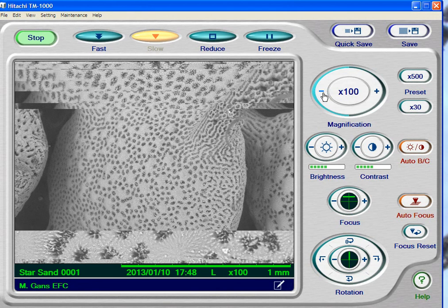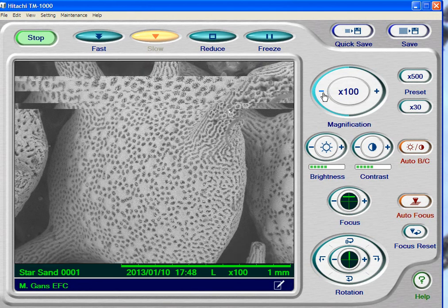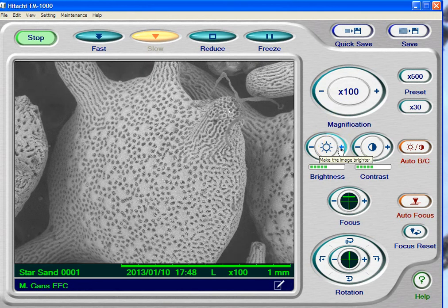Look how nice that looks. Don't forget, one of the things that's almost as important as focusing is adjusting your brightness and contrast. I'm going to drop the brightness down a few notches and then pop the contrast up a little bit.